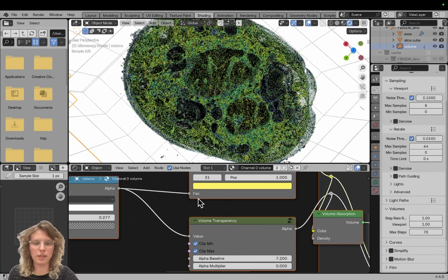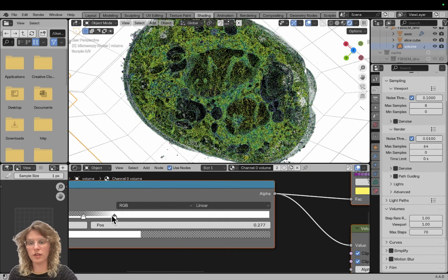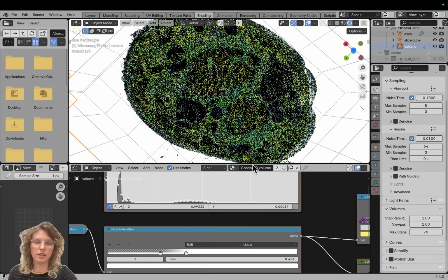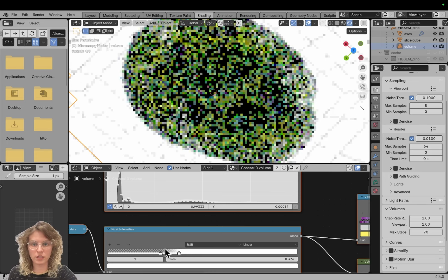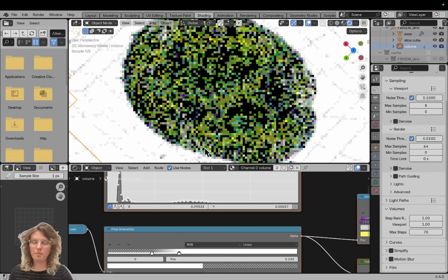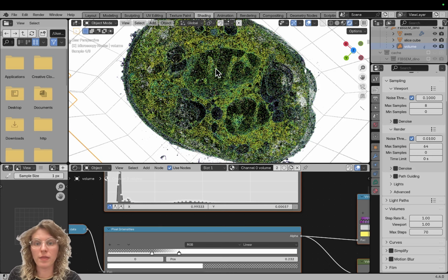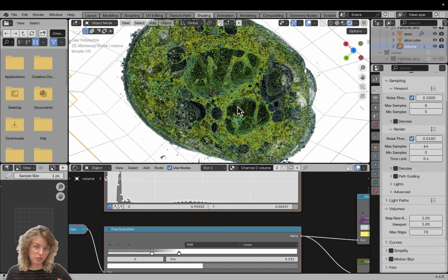different structures by just clipping out both the min and the max, and we only include that range that is within our region of interest, our densities of interest, essentially. And so then, for example, here we can see quite a cool phenotype, that there are these tunnels through the nucleus that this dinoflagellate uses in closed mitosis, where it doesn't disassemble the nuclear envelope with mitosis. It makes a spindle through the nucleus. And so here it still has the tunnels through the nucleus that organized the spindle.